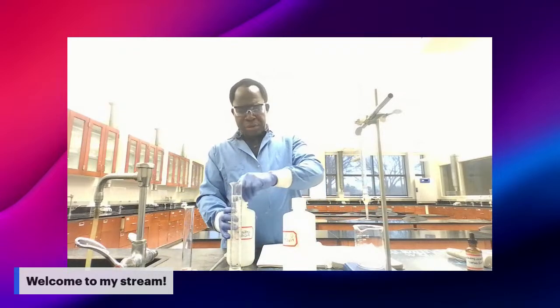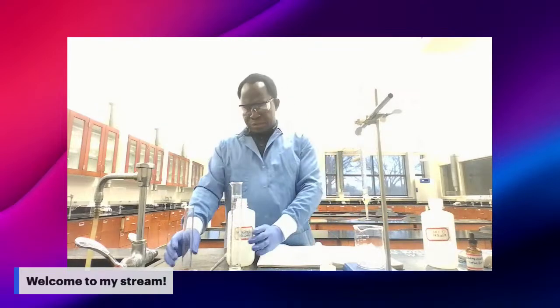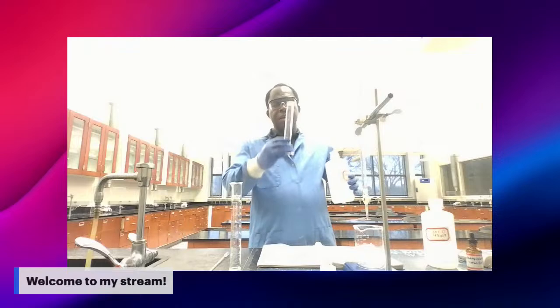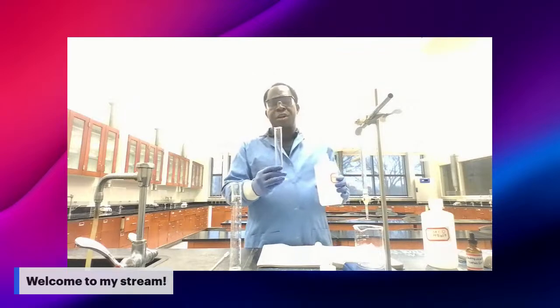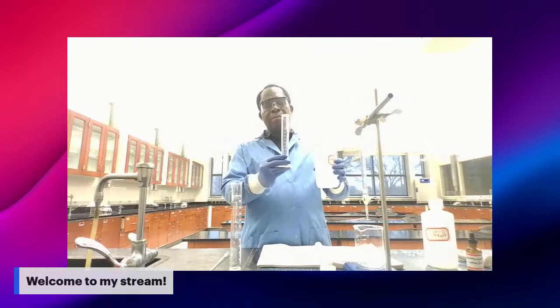Is what we are going to do right away. When you are measuring your volume, make sure you read from the meniscus.